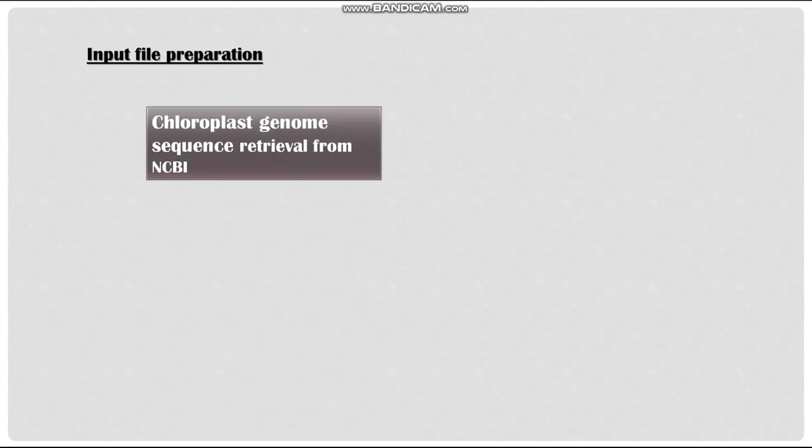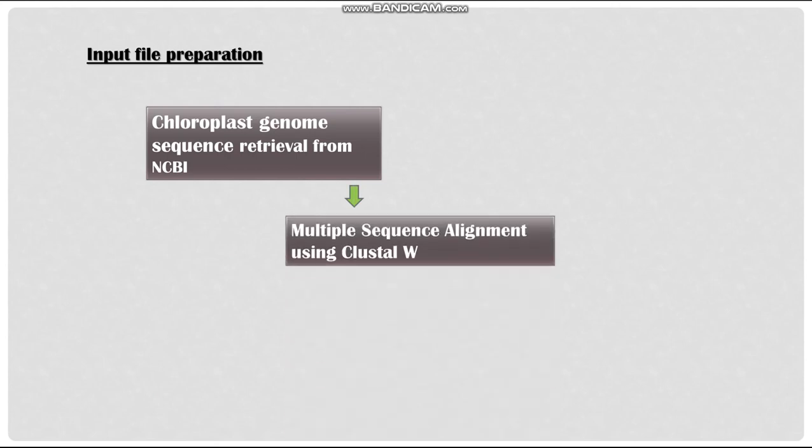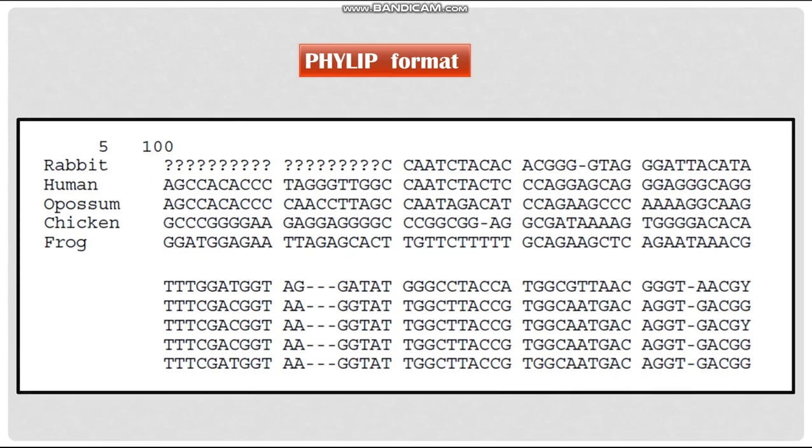For the construction of phylogenetic tree, first we have to prepare the input file. For the preparation of input file, first we have to retrieve the chloroplast genome of the cereal crop from NCBI. After retrieving, perform multiple sequence alignment using Clustal Omega tool and then download the result file in PHYLIP format. The PHYLIP file begins with the information on number of sequences taken and the number of bases or amino acids aligned. Followed by the name of the sequence and then the alignment. In PHYLIP format, the question mark denotes the missing bases or amino acids while the hyphen denotes the gaps in the alignment.